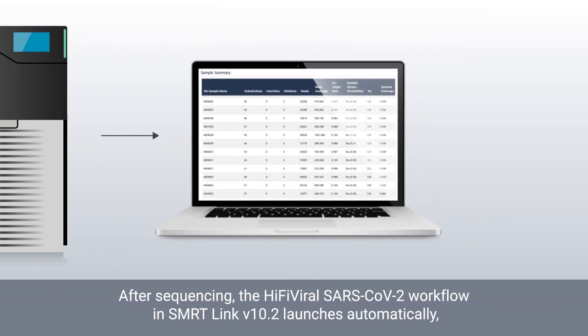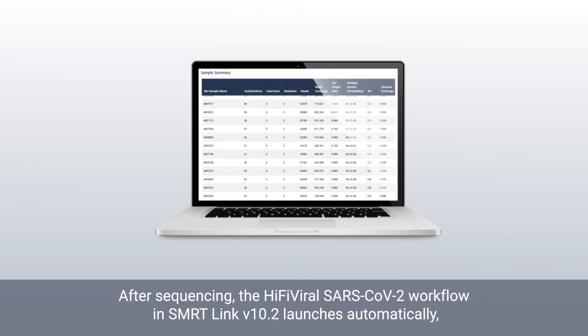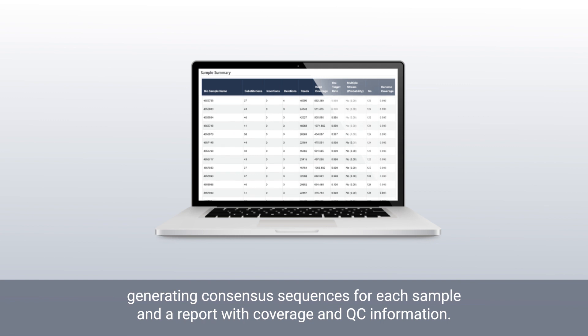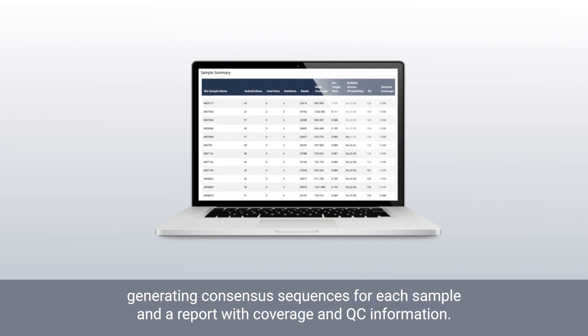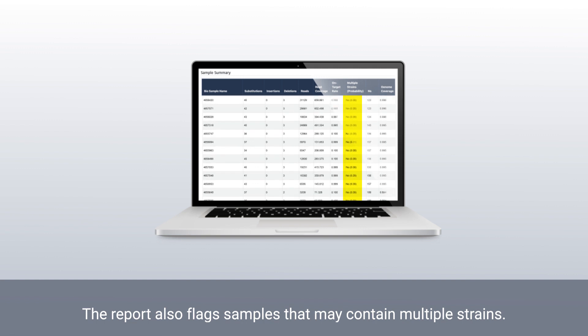After sequencing, the HiFi viral SARS-CoV-2 workflow in SmartLink version 10.2 launches automatically, generating consensus sequences for each sample and a report with coverage and QC information. The report also flags samples that may contain multiple strains.